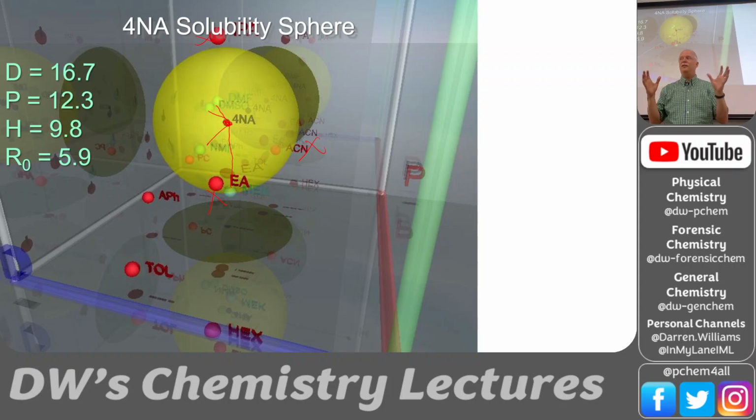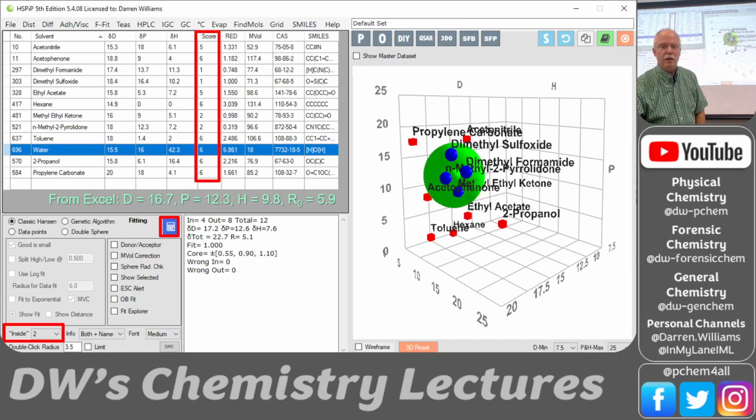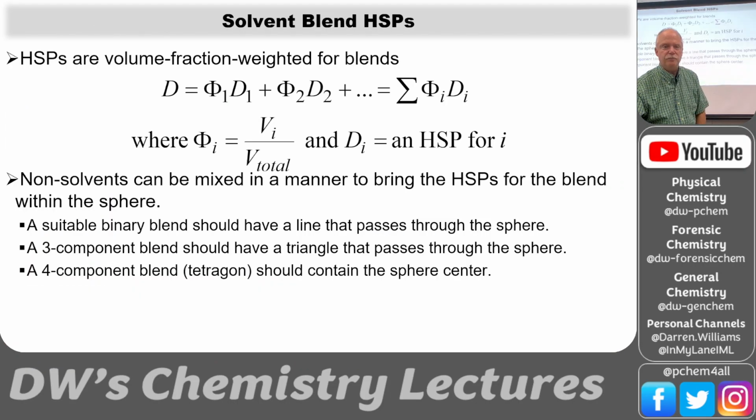Let's say, for instance, which is happening today, the EPA is taking solvents off the market. You can't use this, you can't use that. But if I know the solubility sphere, then I know what solvents I would work to substitute. It also allows us to do blends, okay? And so this is software that can do this.